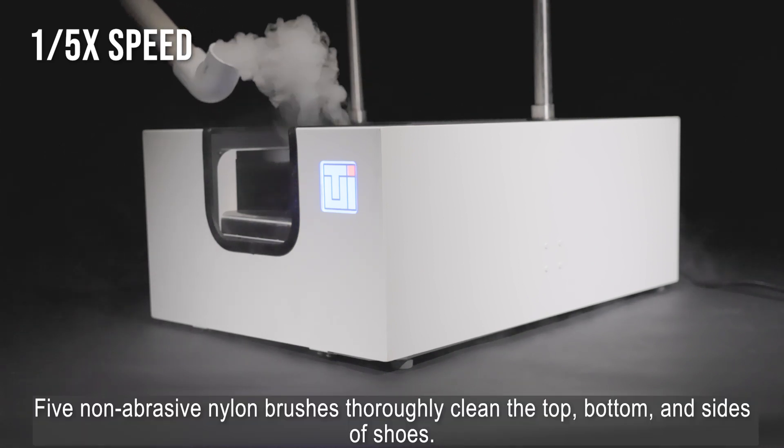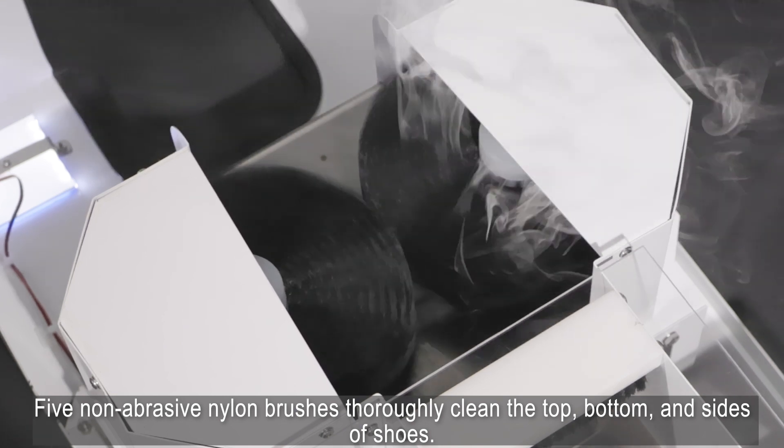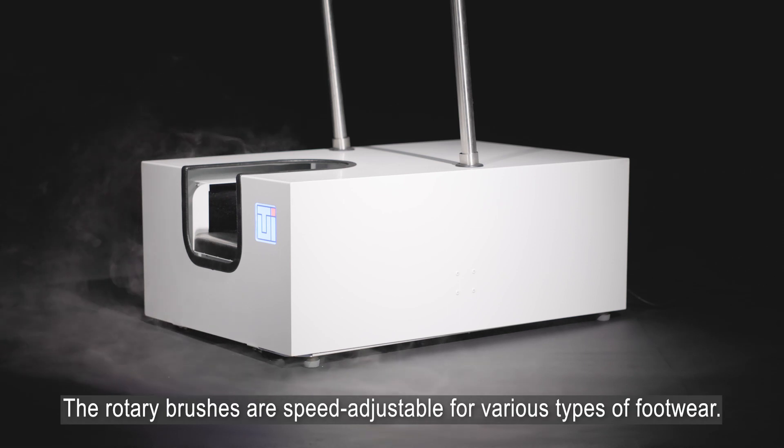Five non-abrasive nylon brushes thoroughly clean the top, bottom, and sides of shoes. The rotary brushes are speed-adjustable for various types of footwear.